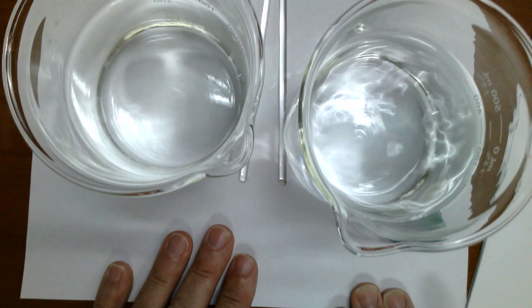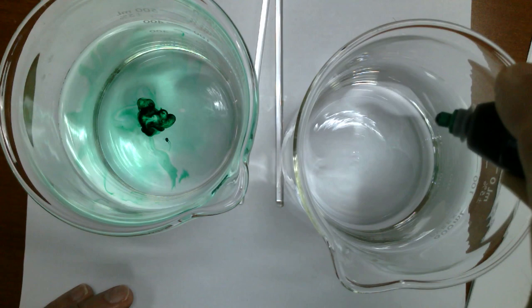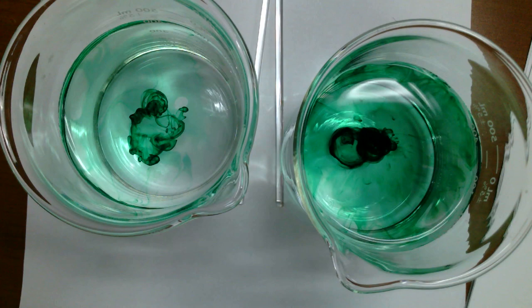So I've got a little demo here. And I've got 400 mils of distilled water in each of these beakers. And so to the beaker on the left, I'm going to add one drop of green food coloring. And to the one on the right, I'm going to add four drops of green food coloring. Okay, you can see them mixing. I'm going to stir each of these up.